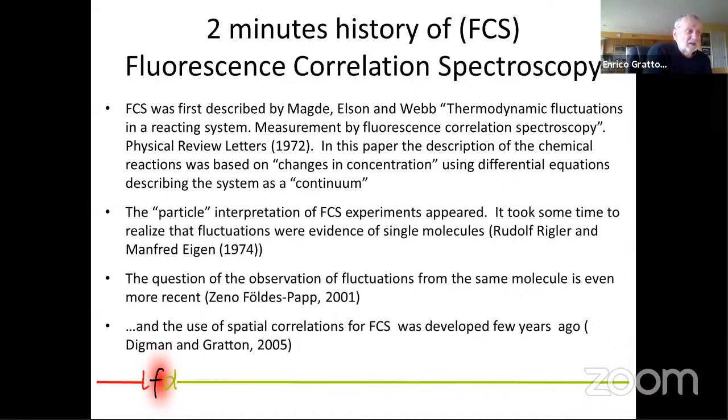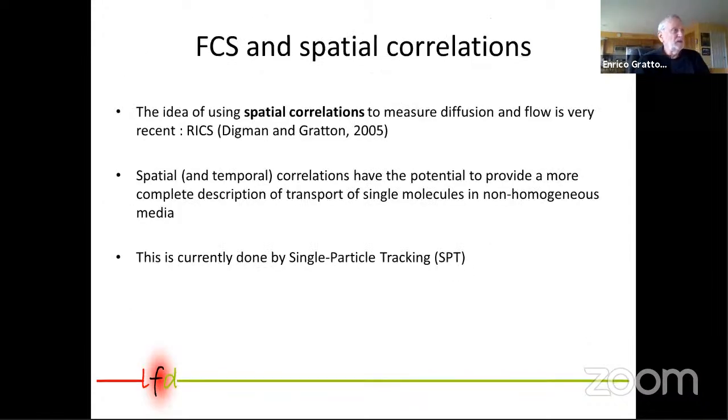And the use of spatial correlation in FCS, so dynamic correlation, was developed, I would say, recently by my work with Michelle Digman and others. But still, there is a concept which is lacking. So let us see what that part is.